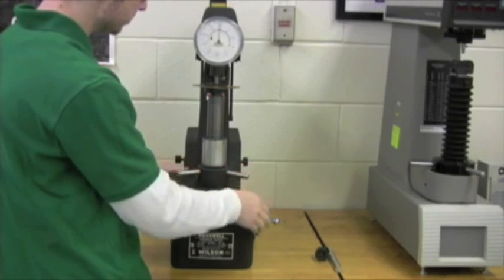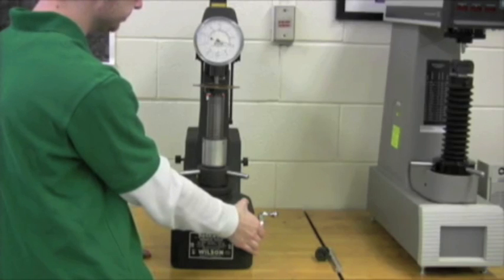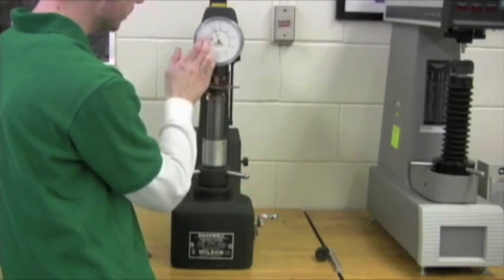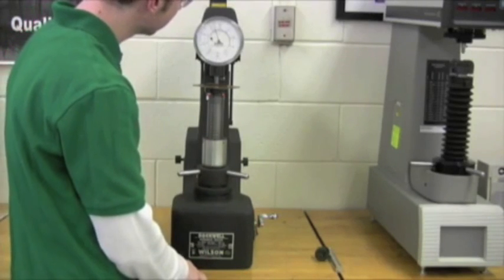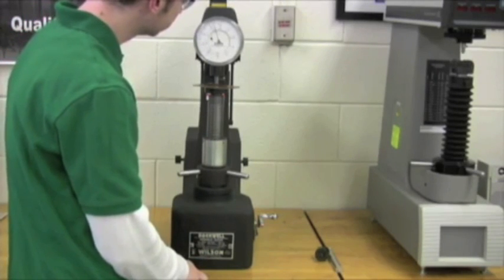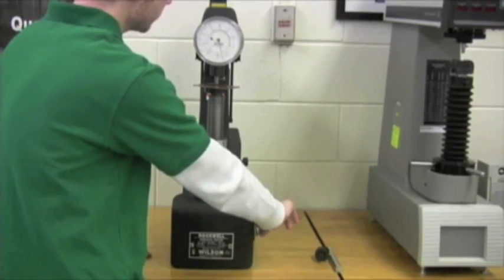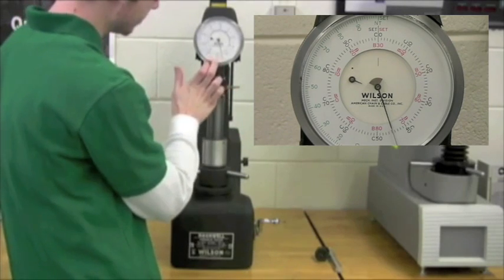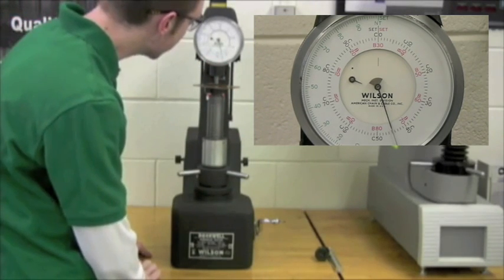So now that everything's zero, we're going to let go of our crank handle. Wait for our long needle to stop moving, which can take a couple seconds. And we're going to pull the crank handle back one more time. And this is our final reading right there at about 45.